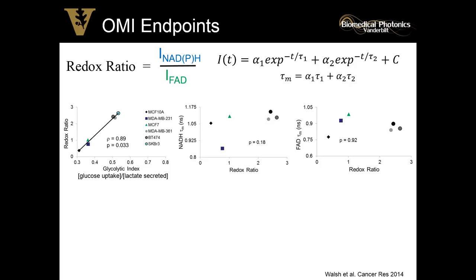And we know from previous papers that both of these variables are very sensitive to cellular metabolism, but in different ways than their intensities. So it makes sense to put all of these variables together because they provide added value when we put them together. And I'll show you data that supports this later.